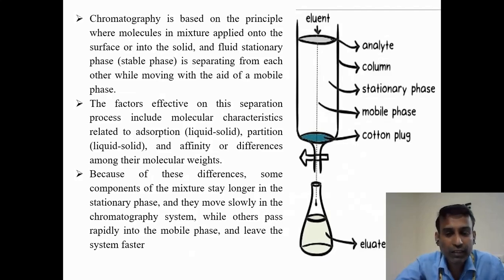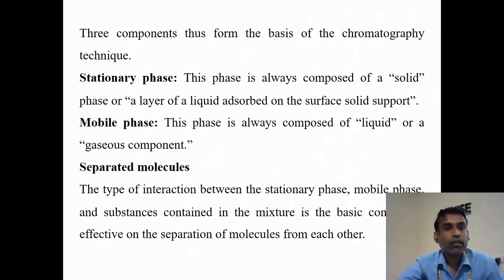Because of these differences, some components of the mixes stay longer in the stationary phase and move slowly in the chromatographic system, while the others move rapidly along with the mobile phase and leave the system.